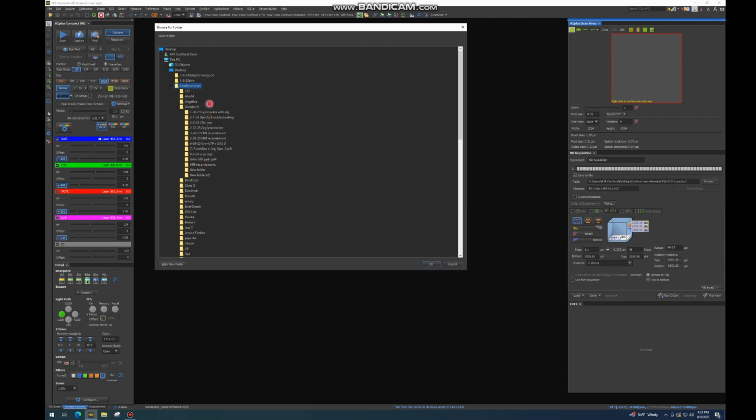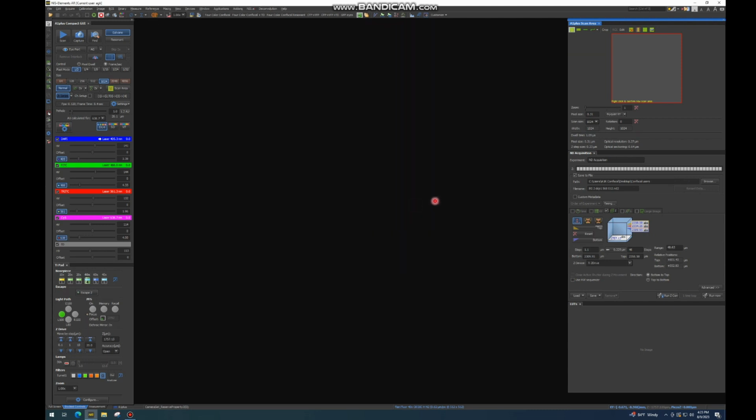Once you decide which folder to direct your images into, the images will save automatically to that folder once you run an image. Another nice thing about the Nikon Elements software is that it'll help you pre-title your images. So if you were to name something wildtype 001 and put a number at the end, the next image you take will actually be wildtype 002. If you change samples, obviously you need to change the name.